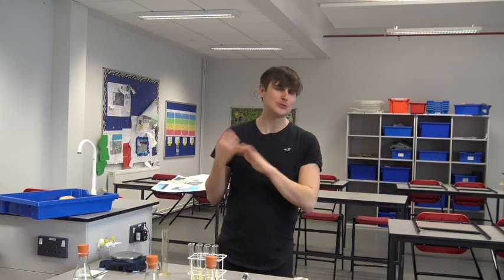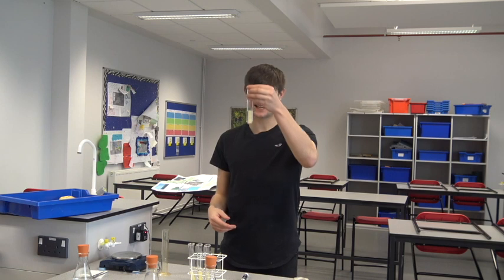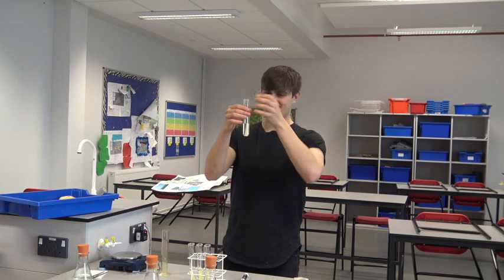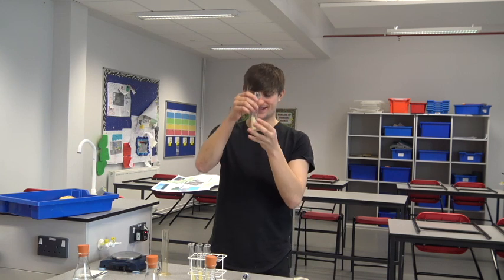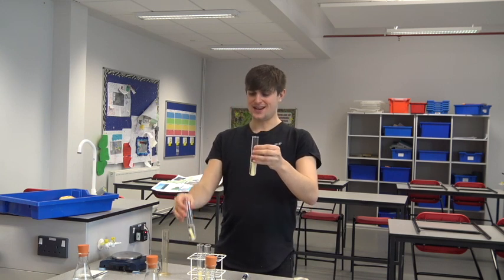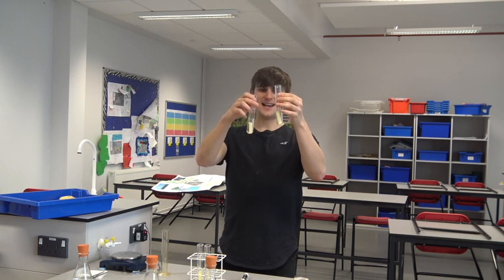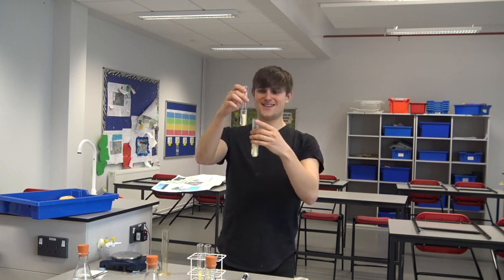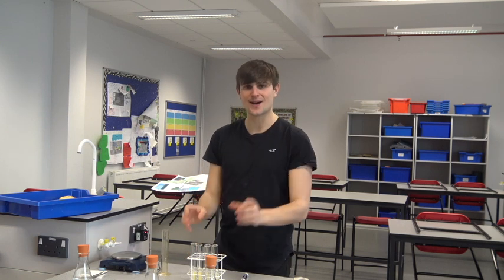I've left this practical around two to three hours and we can actually see visibly that some of these potatoes have got larger and some of them have got smaller. This is the one in pure water, and if I hold it up next to the most concentrated salt solution, you can see this potato has swelled up while the other has got a lot thinner and skinnier. We now need to reweigh our potatoes.